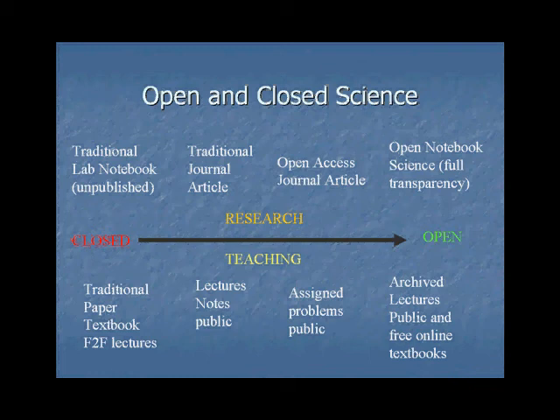So what we're talking about here in Open Notebook Science is full transparency in the scientific process, where actually the lab notebook of my research group is made available in real time using a few different technologies which I will discuss.